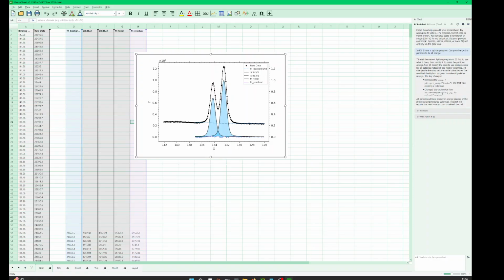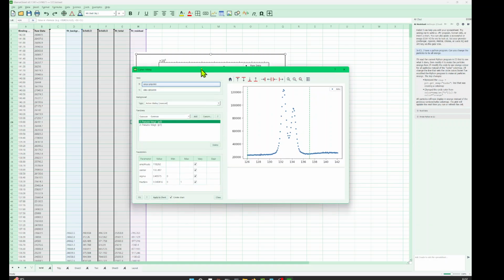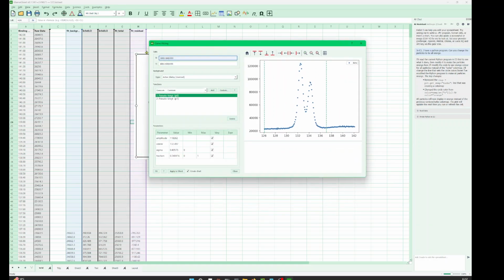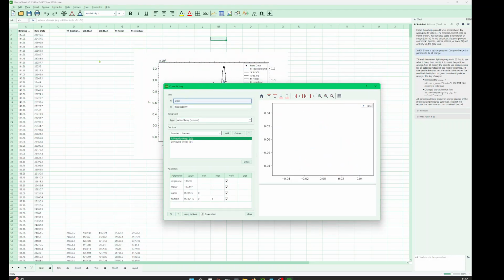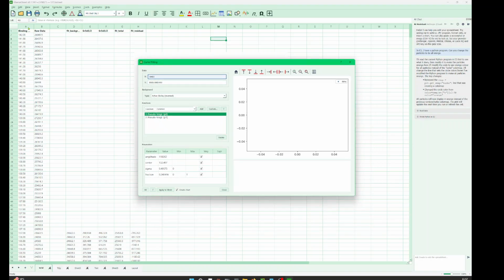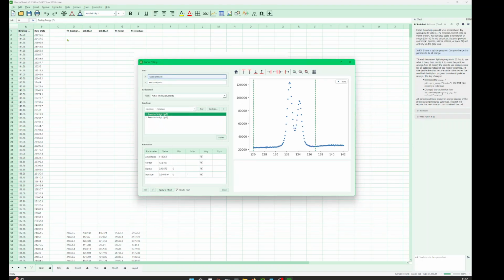But another thing that I've added is this peak fitting window. So this is already taken now from KherveSheet. So now it has access. Let me just go through here. Yeah, that's it. So let's say you start from here. I'm going to select my X, this one. I'm going to select my Y. It's done. And here I've got my range, which now I can create a background.